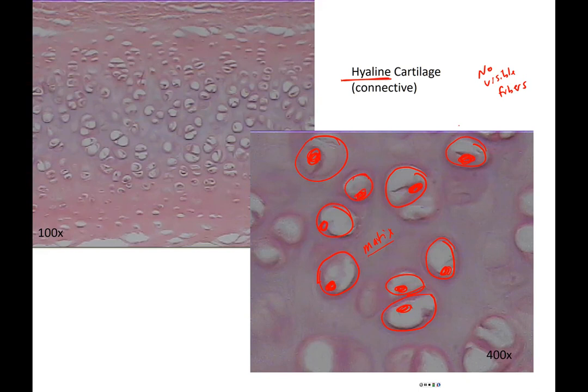These little pockets that I was referring to are called lacunae. The ae ending is plural. I'm pointing here to a single lacuna. These are those little pockets, and then those cells that are here are called chondrocytes, where the prefix chondro means cartilage and that ending c-y-t-e means cell. So look at the arrangement here of the chondrocytes and the lacunae and we'll see a difference as we look at the other types of cartilages. Hyaline cartilage is the cartilage that's really found in your skeleton. So this is the cartilage that is found between your ribs and your sternum. Those are called costal cartilages. This is the cartilage that's found in your synovial or movable joints. So that's going to be another good location here.